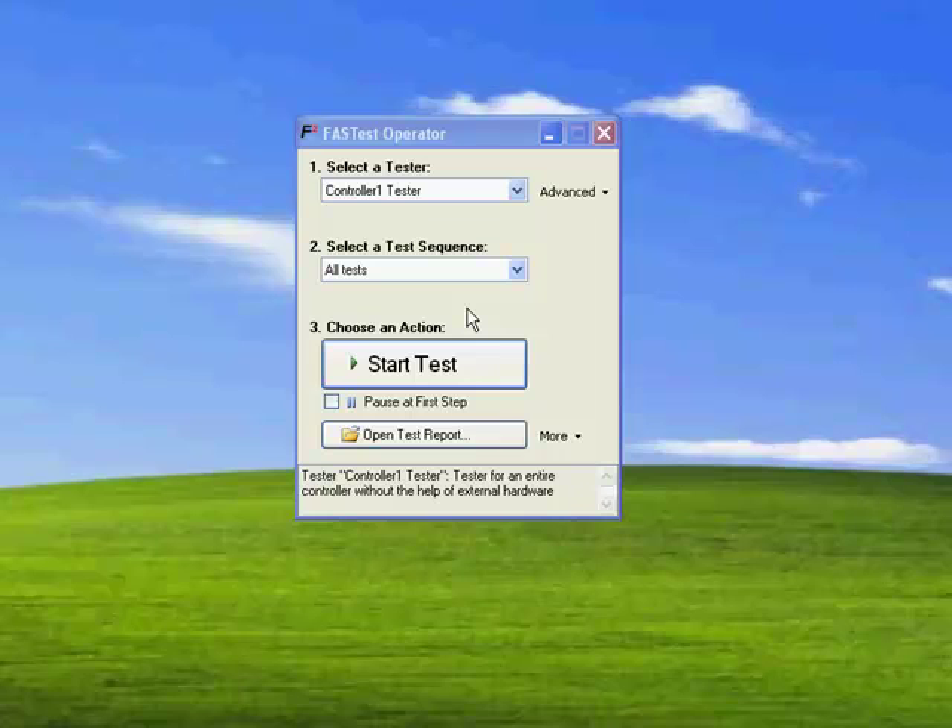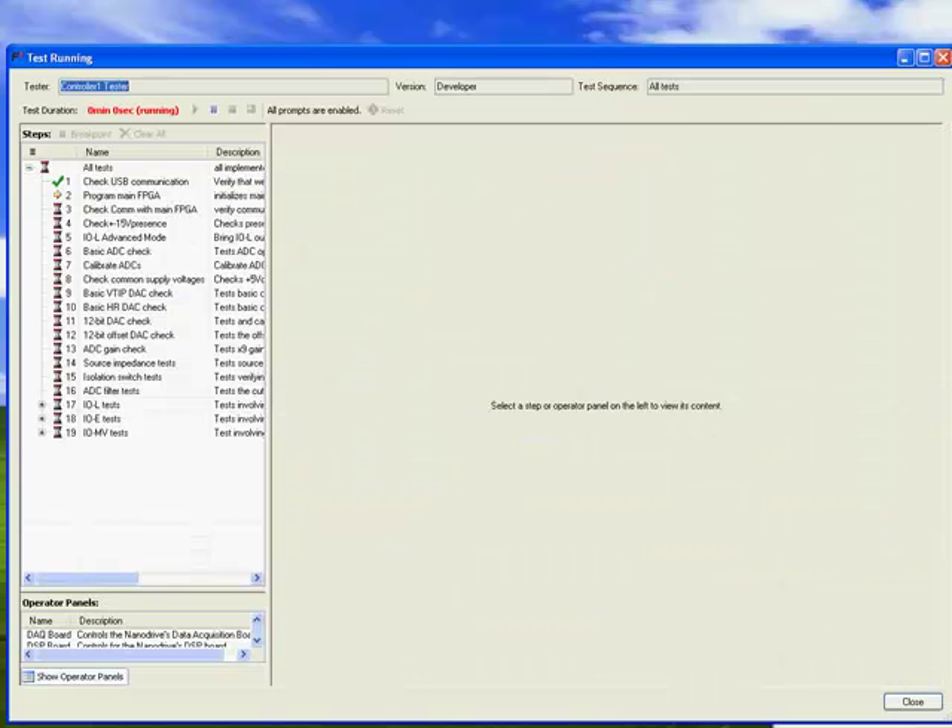The NanoDrive system also comes with a unique self-testing software. This is a Python-based software that allows basically all modules inside the controller to be fully tested for their functionality and performance. We can see the test running here. On the left side is a list of tests being executed, and if they pass they will be marked with a check mark, and if not, with a red cross.